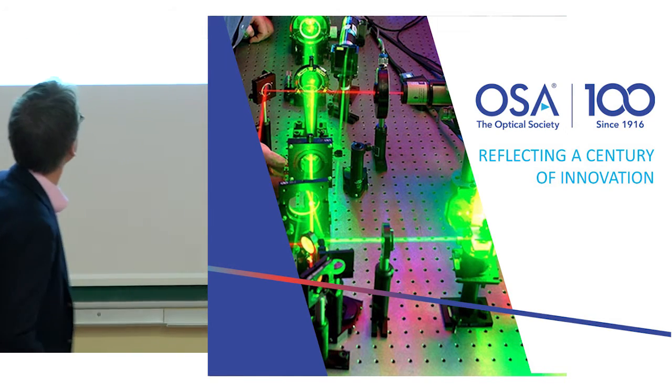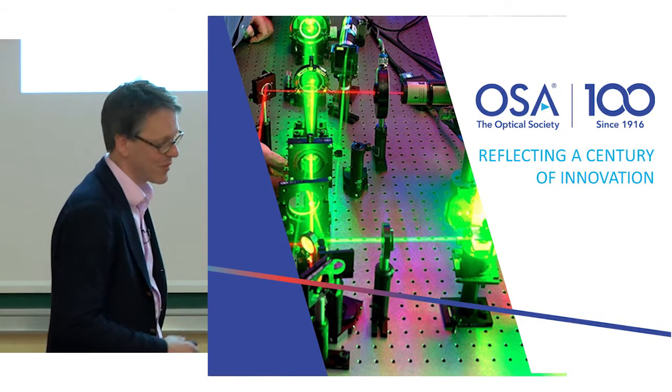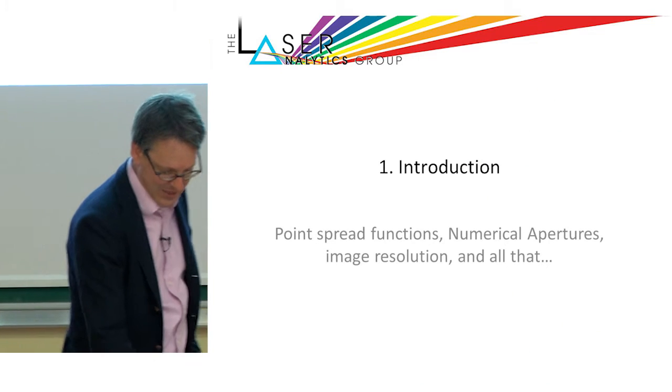All right, so let's start. Let's get into the meat of things and talk about point spread functions, numerical apertures, image resolution, and all that.